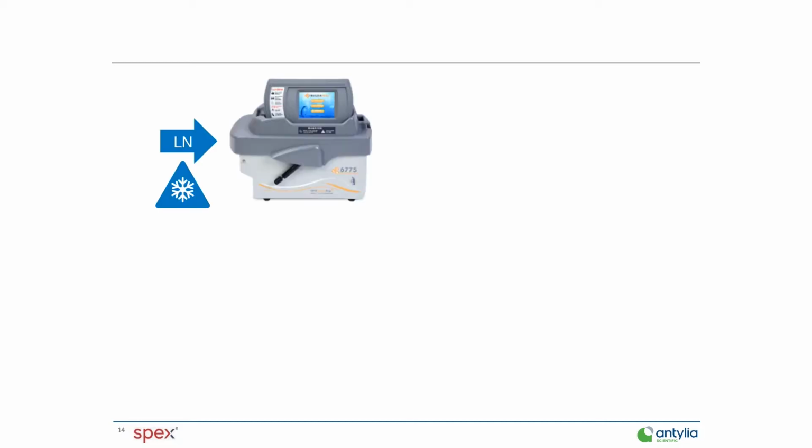Speaking of liquid nitrogen, if you're using it, you're probably using a cryogenic mill of some kind. And this will give you very fine analytical powders. It takes the tissue or the material that you're trying to grind and it embrittles it using liquid nitrogen. So if you're doing DNA and RNA analysis, it's very, very good for that. If you're doing chemical analysis, it's also very good for that.